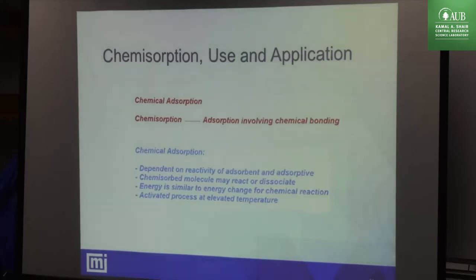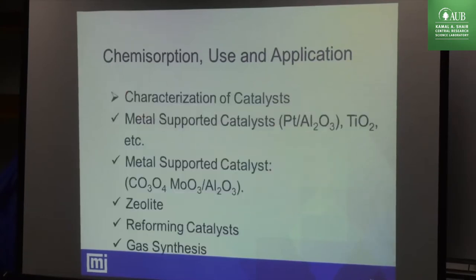The advantage of chemical adsorption is that it is very fast. You put in CO or hydrogen, and it's very fast because the energy of adsorption is very, very high. The reaction is very, very strong, and therefore, in a few seconds, you will get complete adsorption of the gas on the surface of the solid.